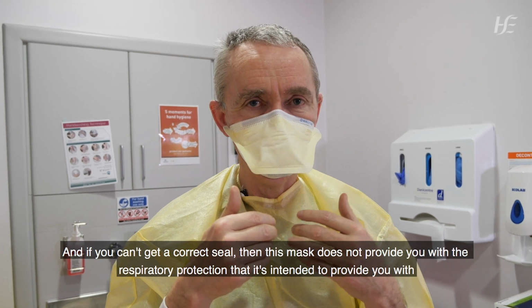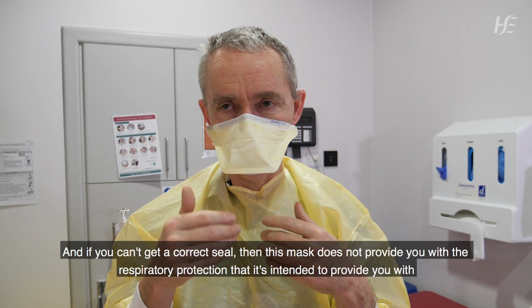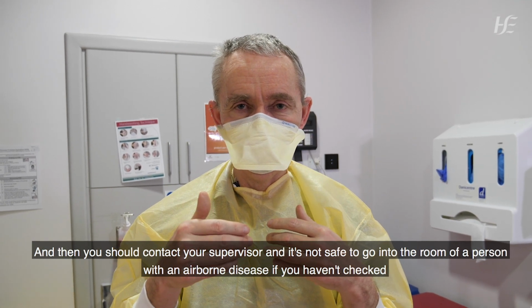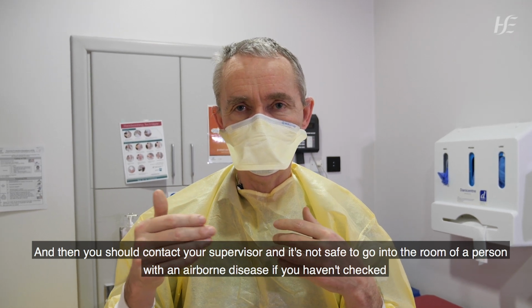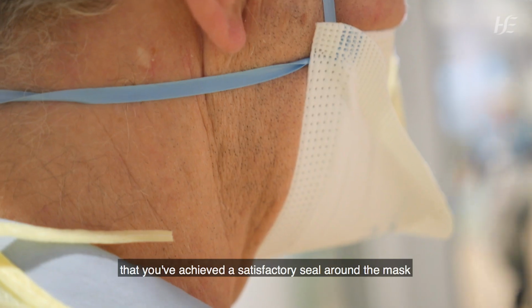And if you can't get a correct seal, then this mask does not provide you with the respiratory protection that it's intended to provide you with, and then you should contact your supervisor, and it's not safe to go into the room of a person with an airborne disease if you haven't checked that you've achieved a satisfactory seal around the mask.